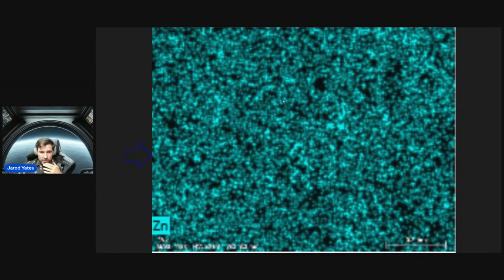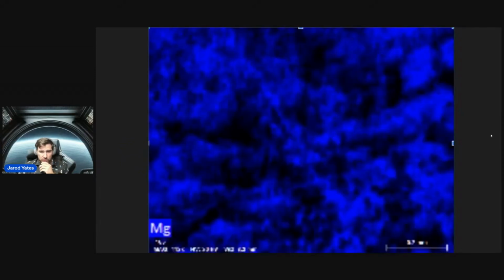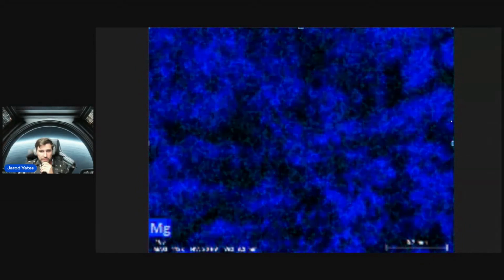It's almost like they're using the zinc as kind of like PCB traces of some kind. Just what I'm seeing. You also have some of these long, straight, curved areas, something to consider. Here I'm going to do a GIF going back and forth between the two. You can see how the zinc kind of follows this straight line here.